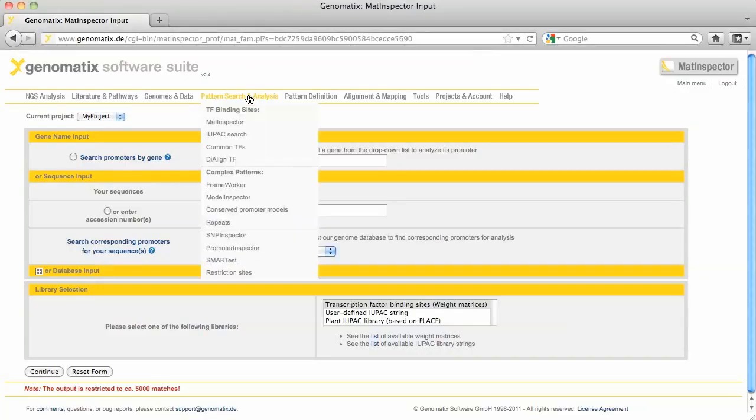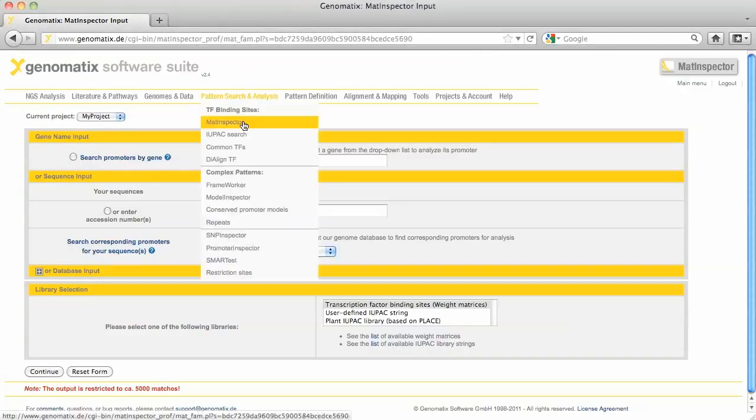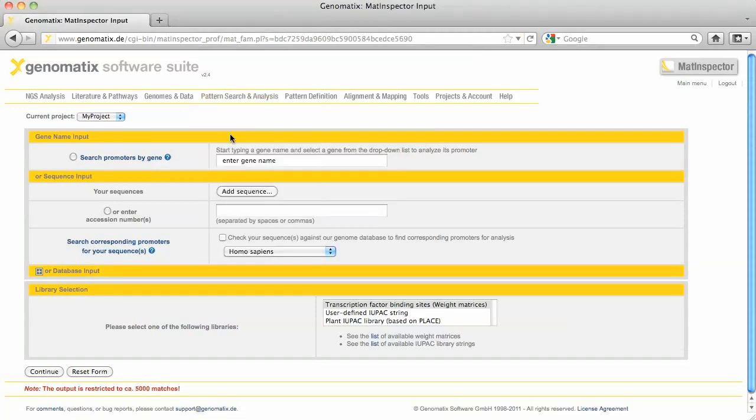You can start MATInspector from the pattern search and analysis menu. You can directly upload one or more sequences for analysis. If you want to analyze annotated promoters of a gene, you can also just enter the gene identifier.